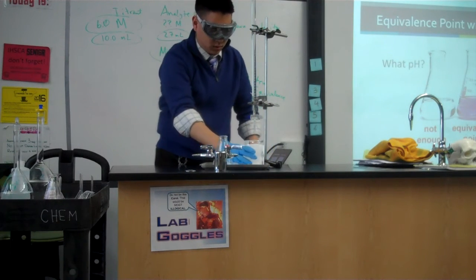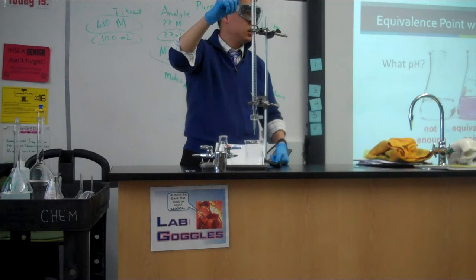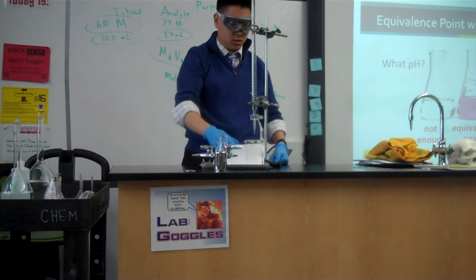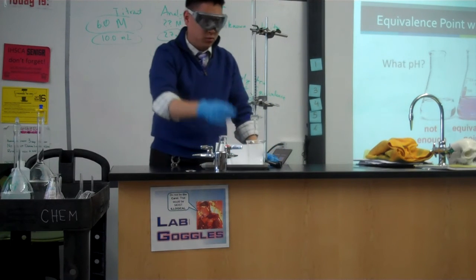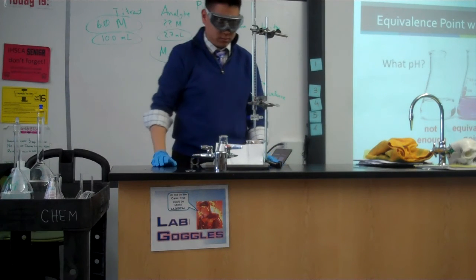Now, the only other problem that presents right now is that even though this says 20, if we pour it out, it's still not going to be 20 because there's a little bit of air here. So we're going to open it up so that the tip fills up and our reading is actually accurate. We're going to get a few drips coming out. A few more, just in case. Okay. So now we have our level, which is almost exactly 20.